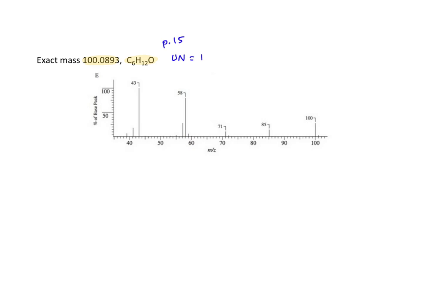In the mass spectrum, we can see the loss of methyl group, M minus 15, and M minus 29 for the loss of an ethyl group. The even-numbered fragment at mass over charge of 58 is evidence for a McLafferty rearrangement. Finally, we also see loss of propyl groups at 57 and loss of a butyl group at M over Z of 43, which is the base peak.